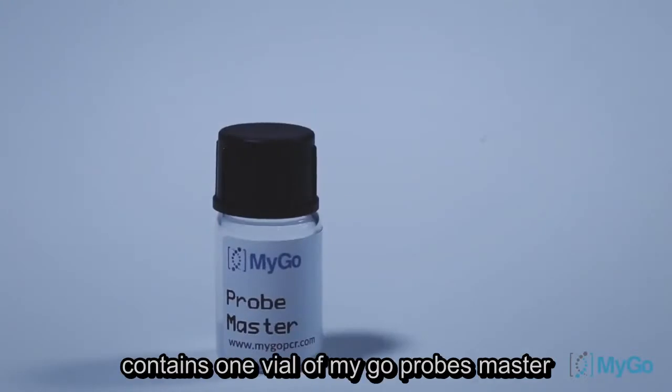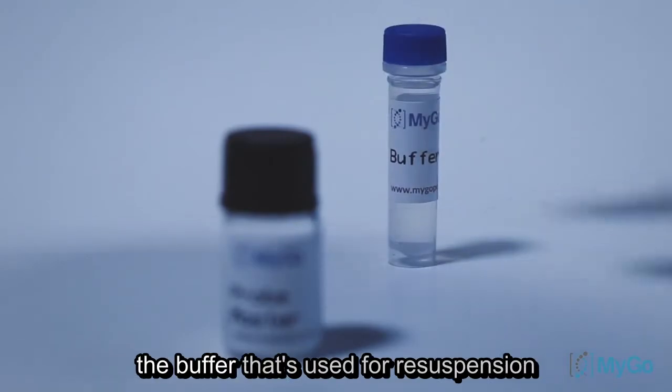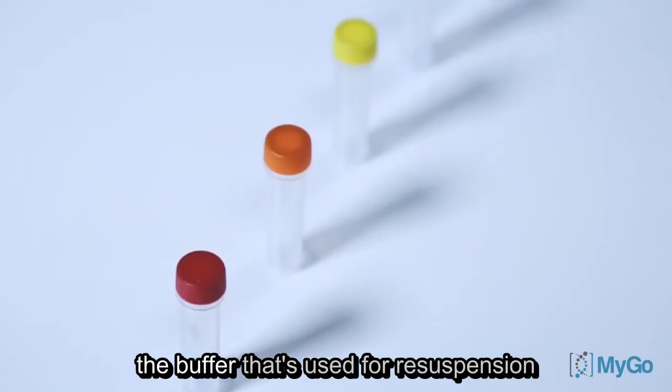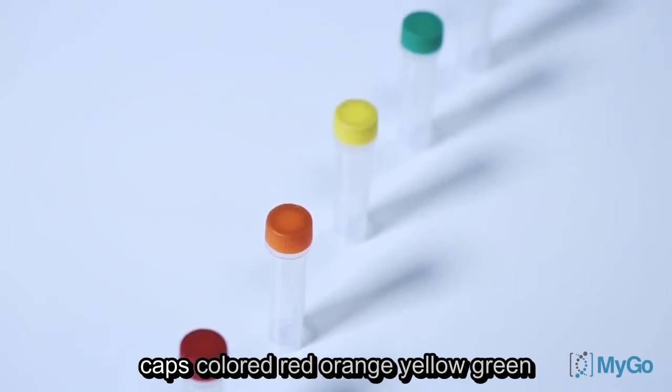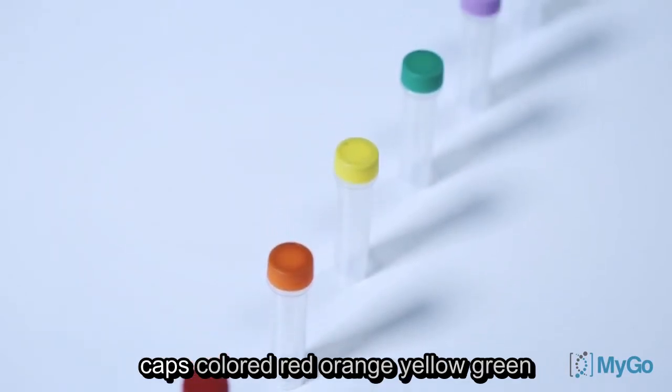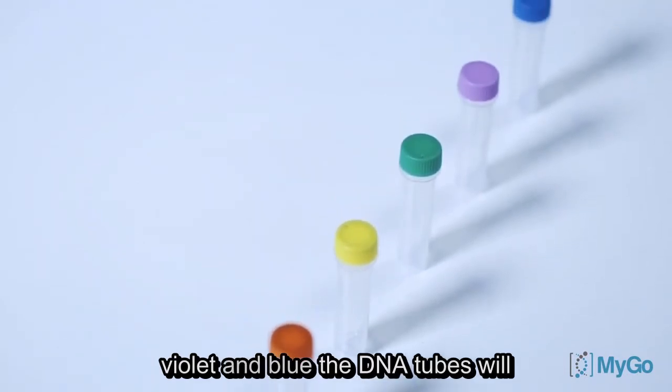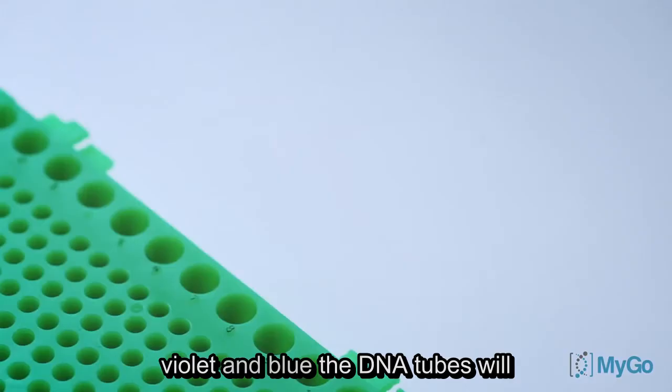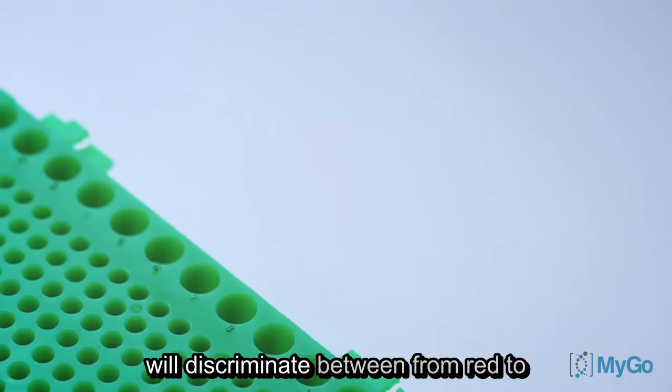The kit contains one vial of MyGo Probe Master, which is a lyophilized master mix and a buffer that's used for resuspension. The kit also contains six DNA tubes with caps colored red, orange, yellow, green, violet and blue.